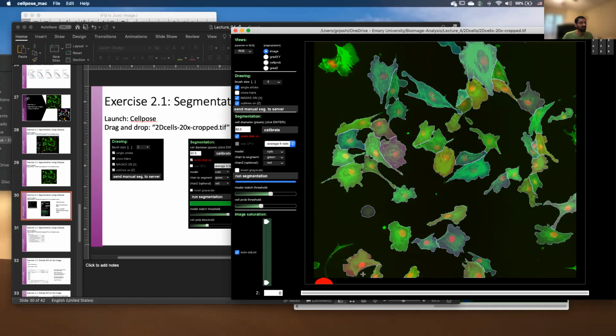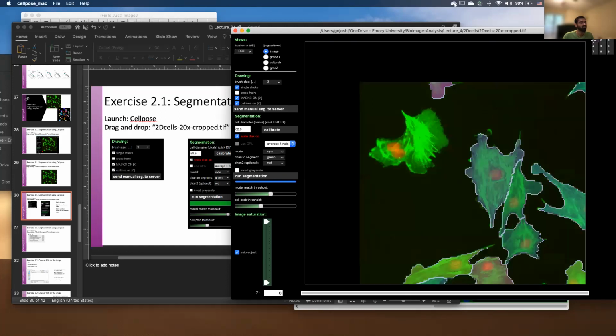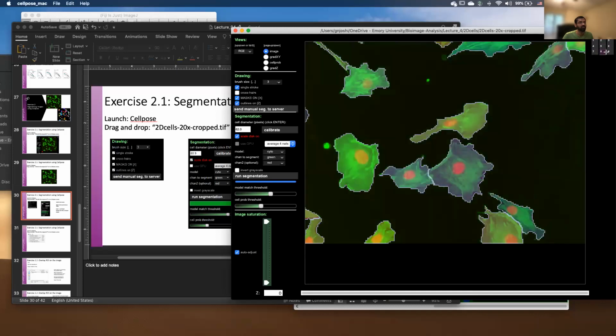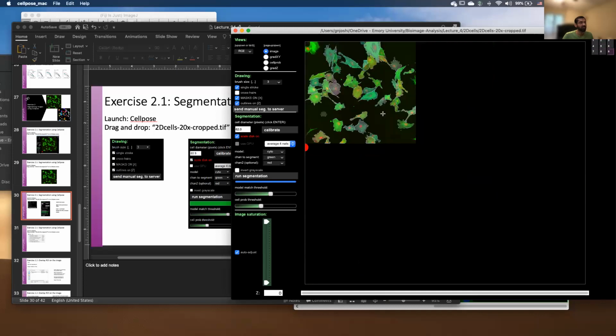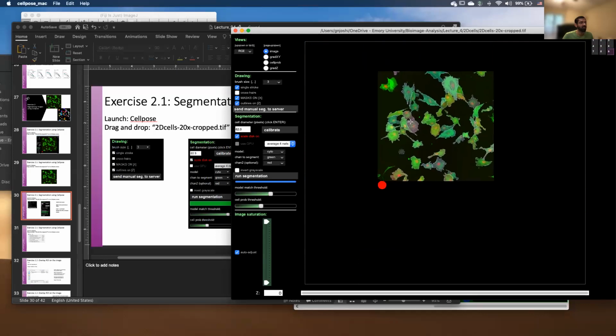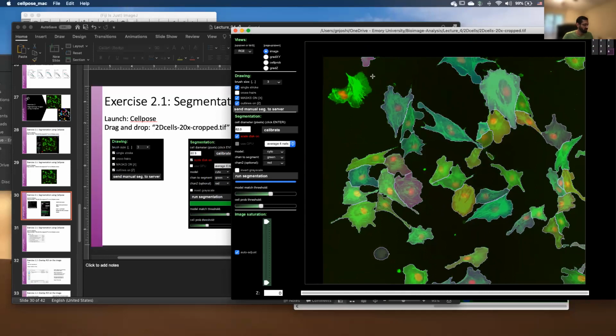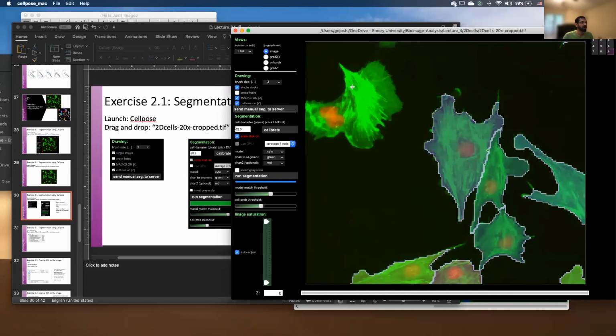All right. Now, if I want to draw something, I can go ahead and if you, let's say, want to zoom into this, you can press 1 and you go into that quadrant. So this lets you go into different quadrants within your image. You can scroll back and forth to zoom in and zoom out. That also works, okay?